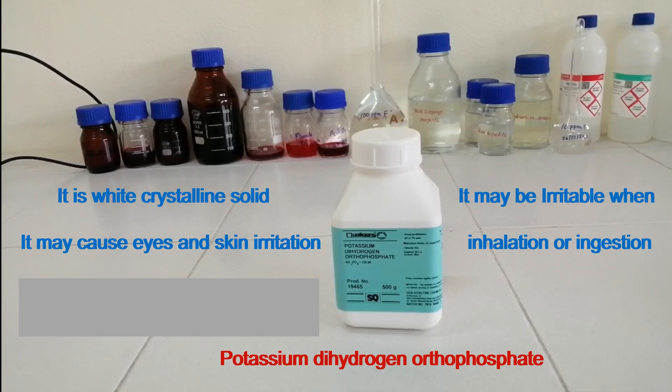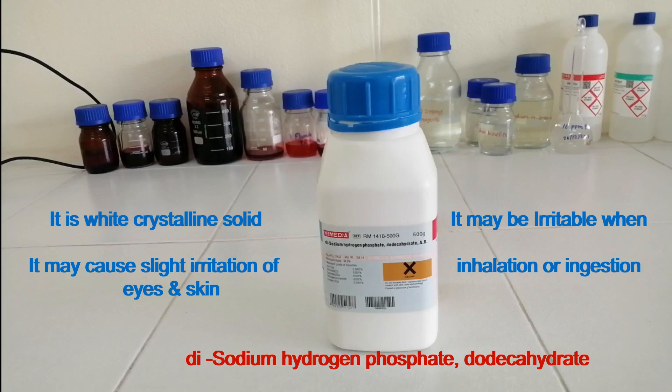Potassium dihydrogen orthophosphate may cause eye and skin irritation; it may be irritating when inhaled or ingested. Disodium hydrogen phosphate dodecahydrate is also a white crystalline solid. It may cause slight irritation of eyes and skin and may be irritating when inhaled or ingested.